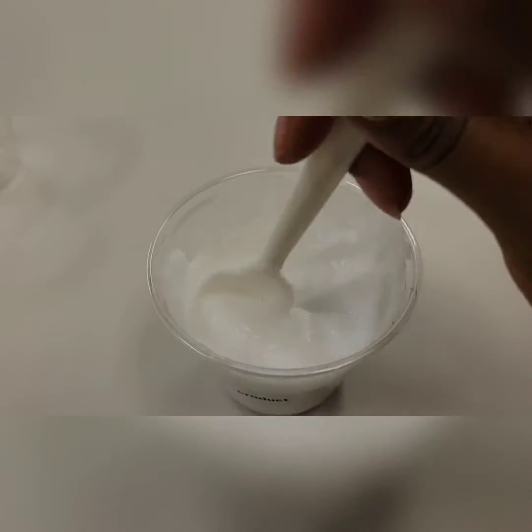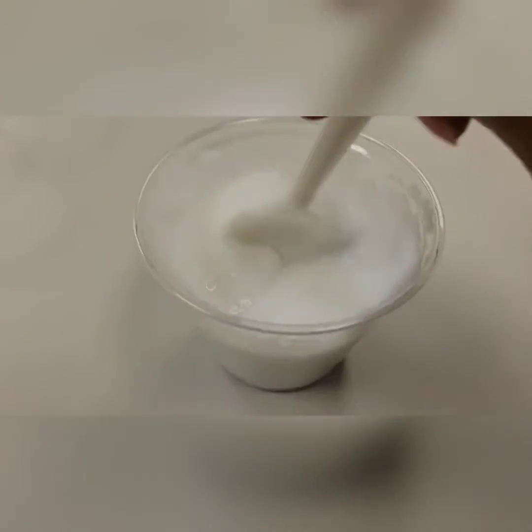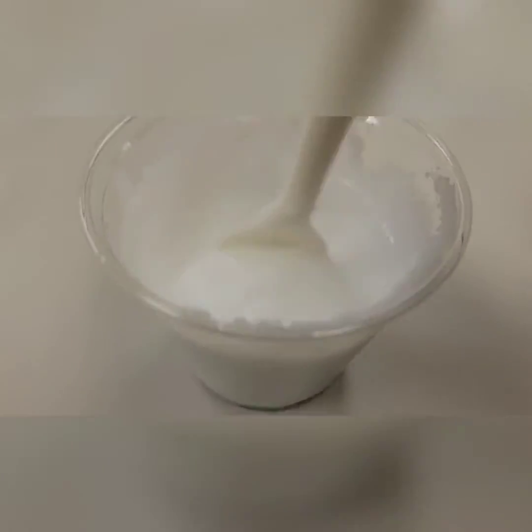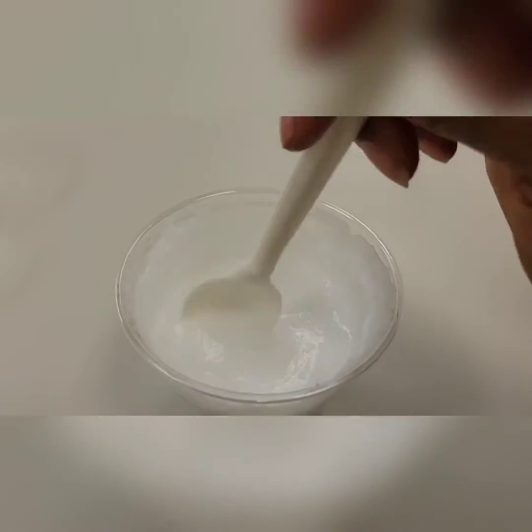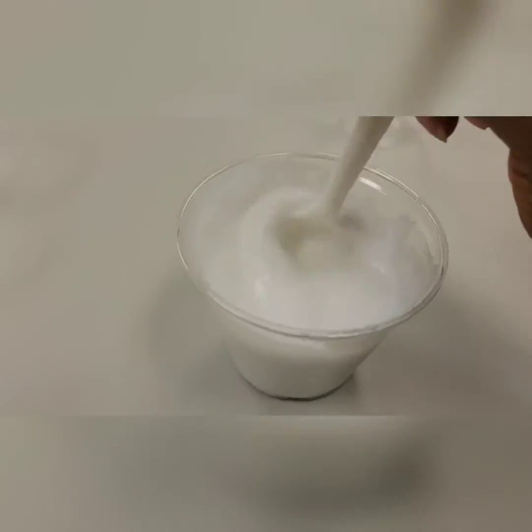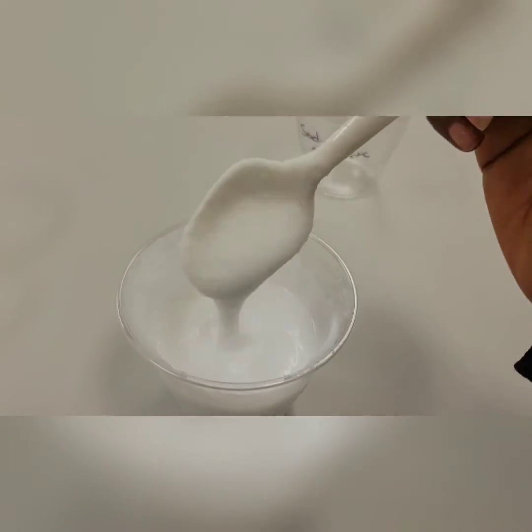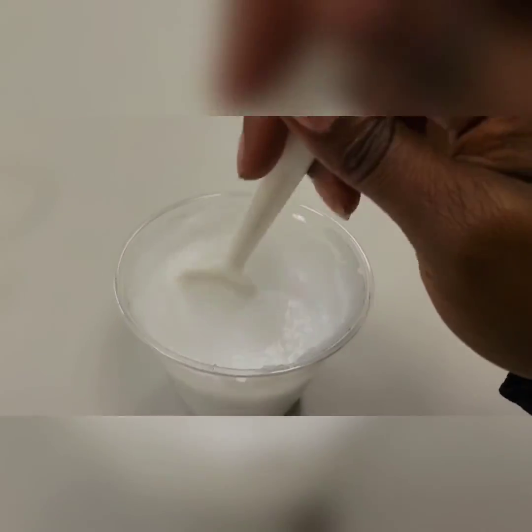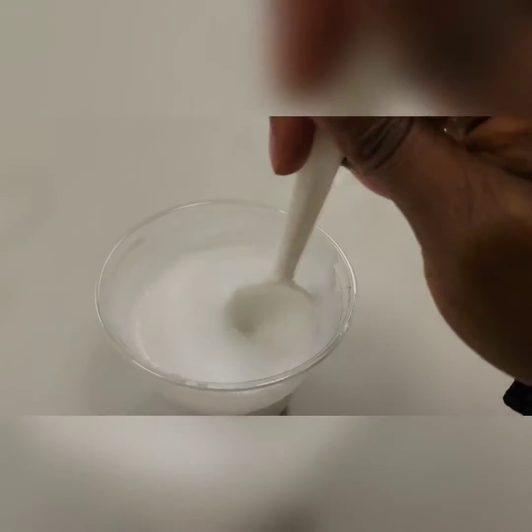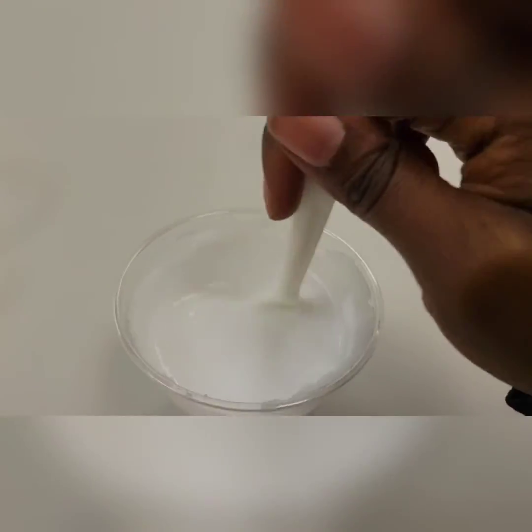So you can see the color has changed significantly. Even the thickness of it, the more I stir, is changing. So you can see it is now a darker white color. And now it is even thinner than it was roughly 30 seconds ago.